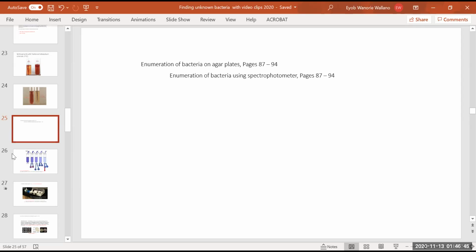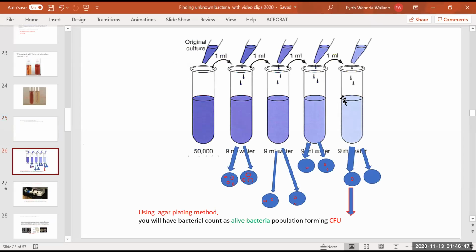Look now here. Are we going to do this one? Well, we are not going to do dilution, but look, there are bacteria here. I made colonies. The colonies are reddish, pinkish, here on this surface. Now, they are live bacteria. Why focus on live bacteria? Live bacteria grow, they don't die.